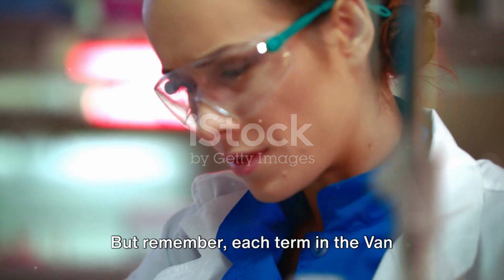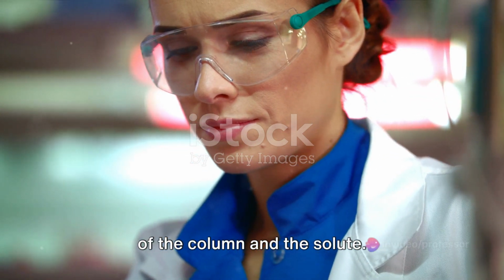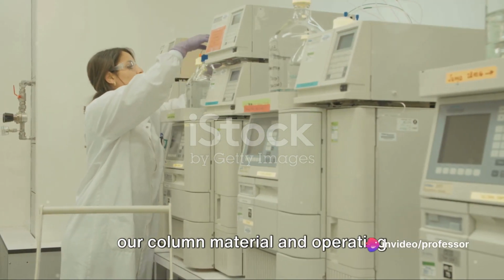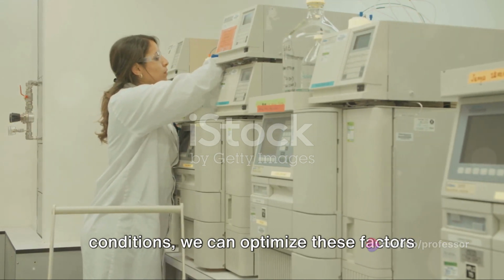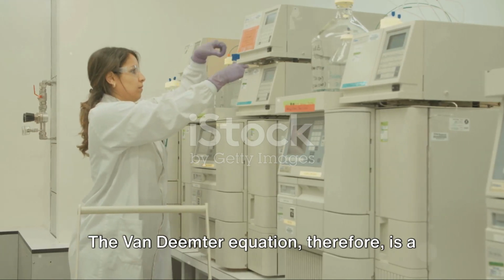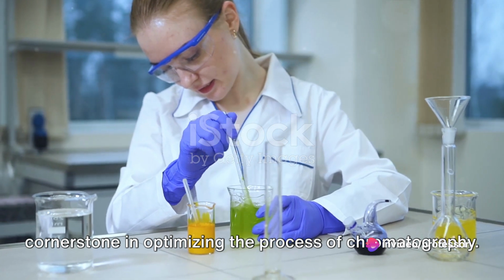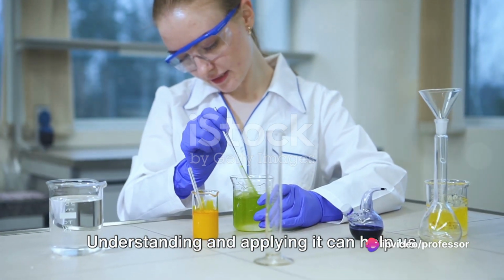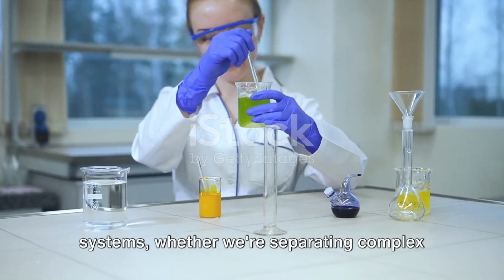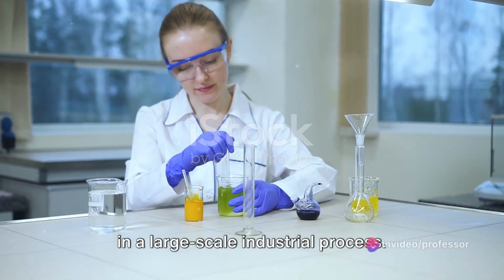But remember, each term in the Van Deemter equation depends on the properties of the column and the solute. This means that by carefully selecting our column material and operating conditions, we can optimize these factors and improve the efficiency of our column. The Van Deemter equation, therefore, is a cornerstone in optimizing the process of chromatography. Understanding and applying it can help us make the most of our chromatographic systems, whether we're separating complex mixtures in a lab or purifying a product in a large-scale industrial process.